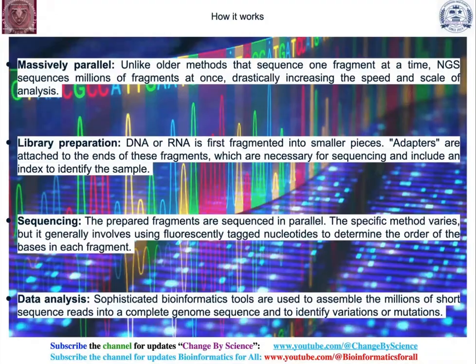What does it mean by massively parallel? It means that unlike older methods that sequence one fragment at a time, NGS sequences millions of fragments at once, drastically increasing the speed and scale of analysis.